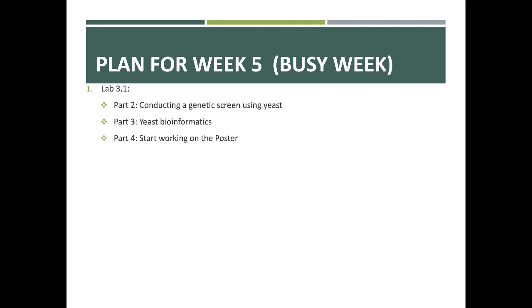The rest of this PowerPoint will be devoted to 3.1, but more specifically, we're going to talk about how we're going to use yeast to construct a genetic screen. And then we're going to spend some time looking at some yeast bioinformatics, and then you should start working on your poster. Again, please don't put your poster off until the end of the week. Rather, work on it a little bit at a time.